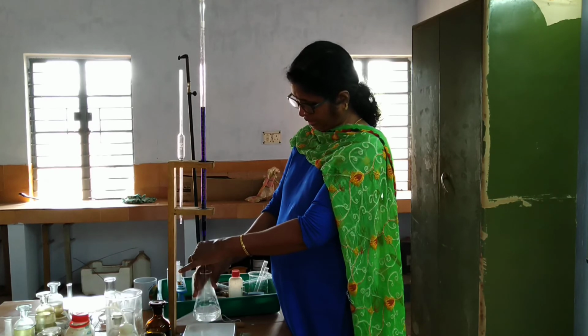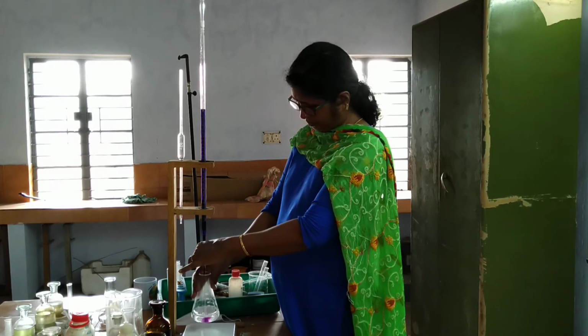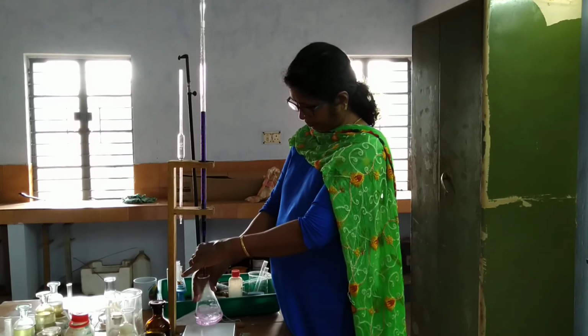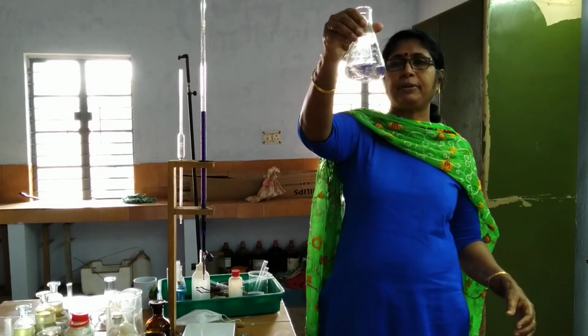Slowly you will have to add. And you see you got a slight pink color on addition.